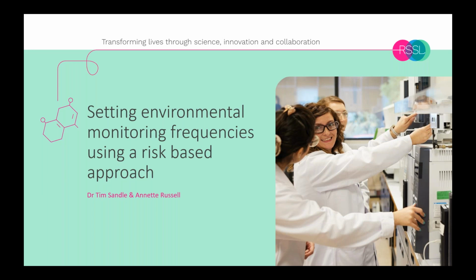So today's webinar is setting environmental monitoring frequencies using a risk-based approach.